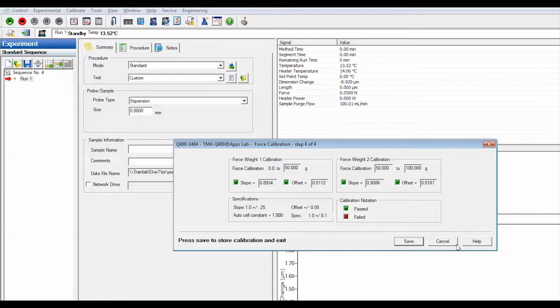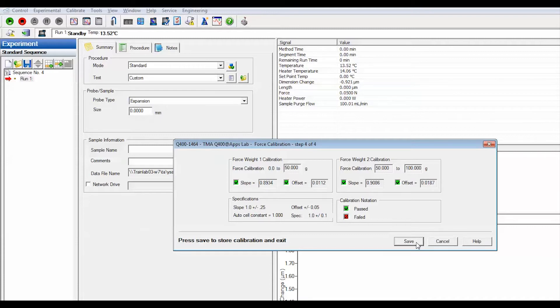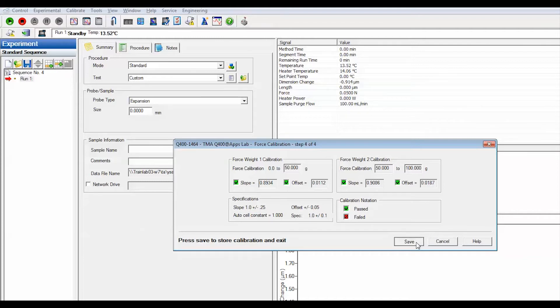Select cancel if any box is marked in red color. This means the values do not fall within the acceptable range and the calibration procedure needs to be repeated. Select save if all boxes are marked in green color. This means the calibration is successful.